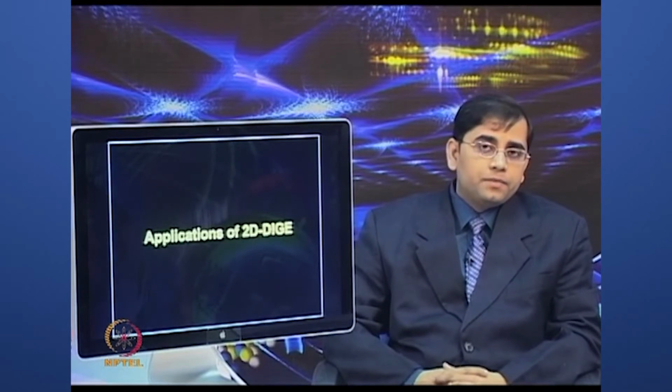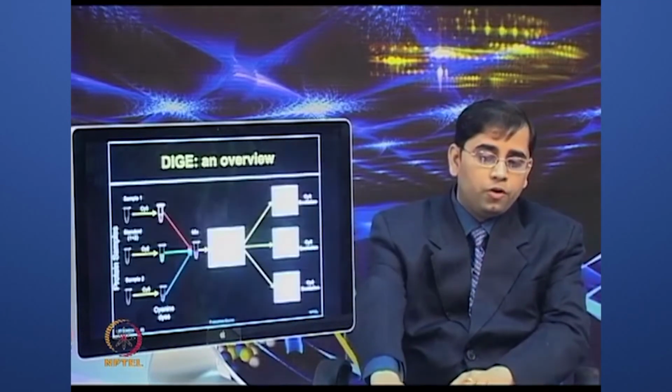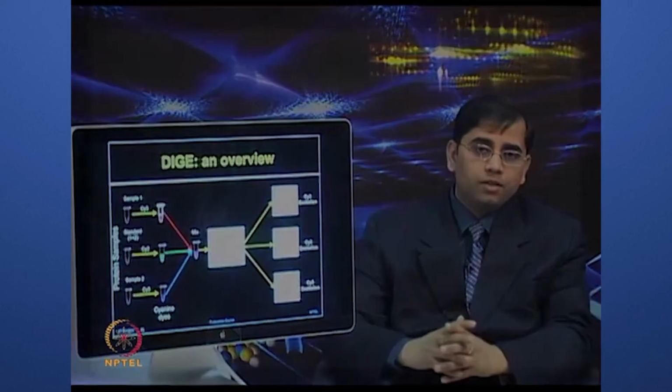So, let us look at some case studies on the 2-dimensional difference in gel electrophoresis. But before we touch upon the case studies, let me give you an overview of the DIGE technique.